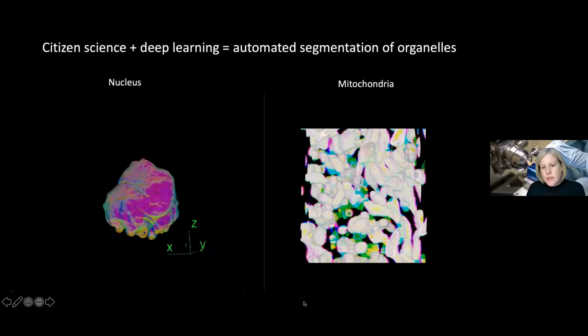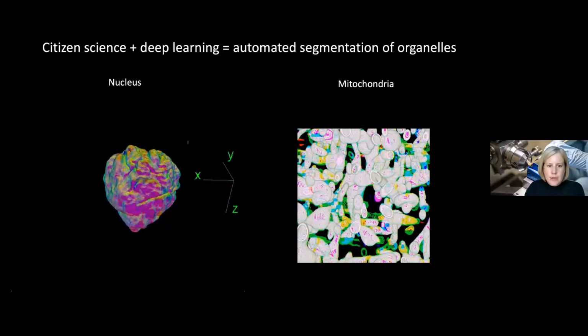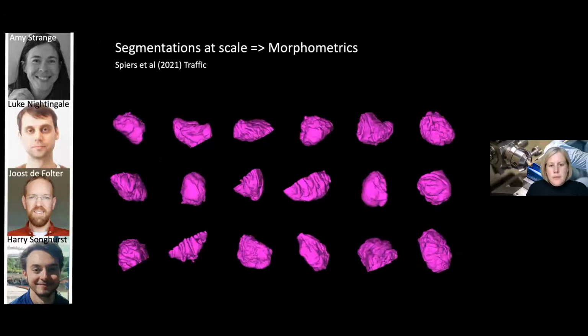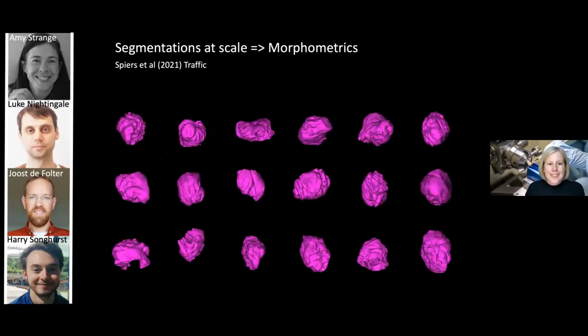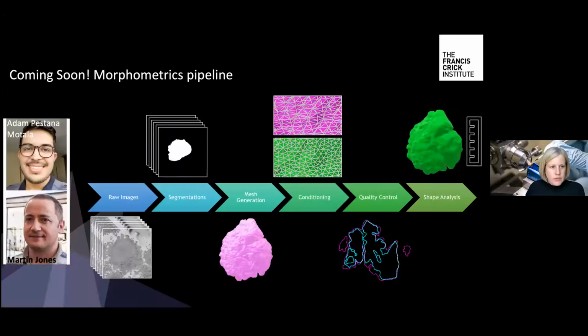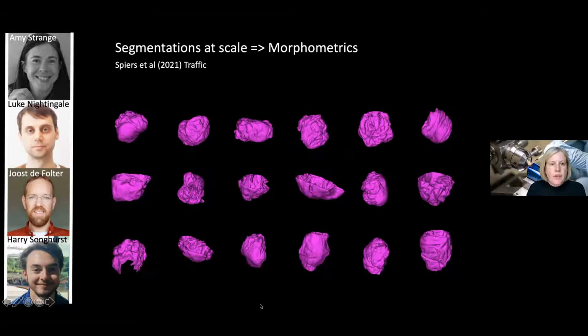And we've now done the same with mitochondria. So this is from our EtchAcell project Powerhouse Hunt, using the algorithms from the nucleus to run on mouse and rat brain data, which was part of the Mito-EM challenge that was out recently. And what this all means is that we're starting to reconstruct whole organelles at scale, not organisms yet. And that means that we can start to think about morphometrics, so we can start to think about converting our qualitative volume EM data into real quantitative results.